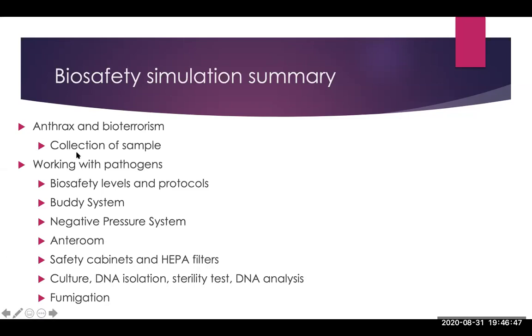Okay. So it's going to talk about anthrax and this bioterrorism threat. They're going to collect a sample, and the goal is to determine if the sample really is anthrax or not. In order to work with that sample, you need to work safely with the potential pathogen.